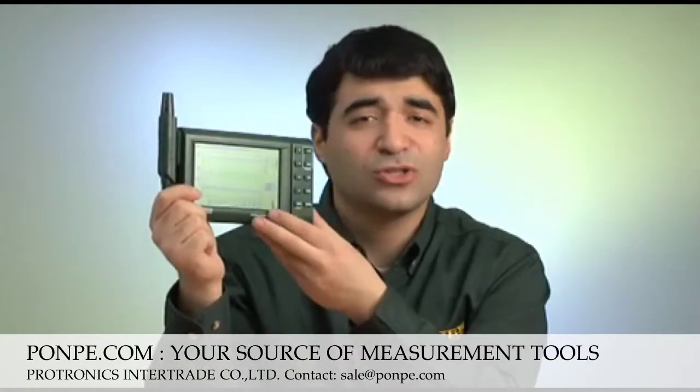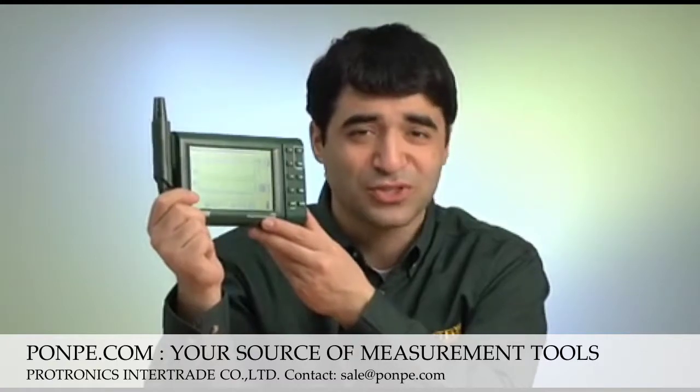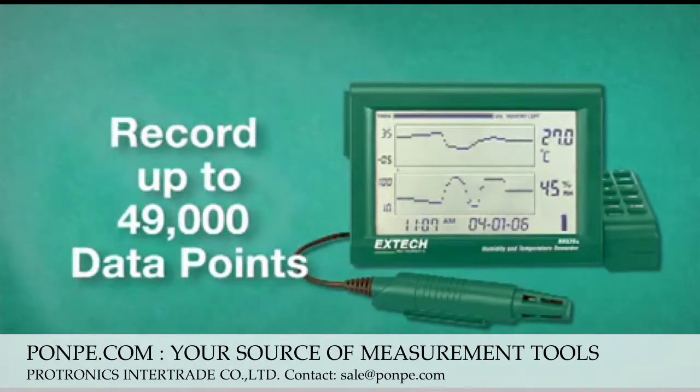The RH520 features a large, dual-LCD display with adjustable vertical and horizontal resolution. The RH520 can record up to 49,000 data points and can be transferred to PC for further analysis.